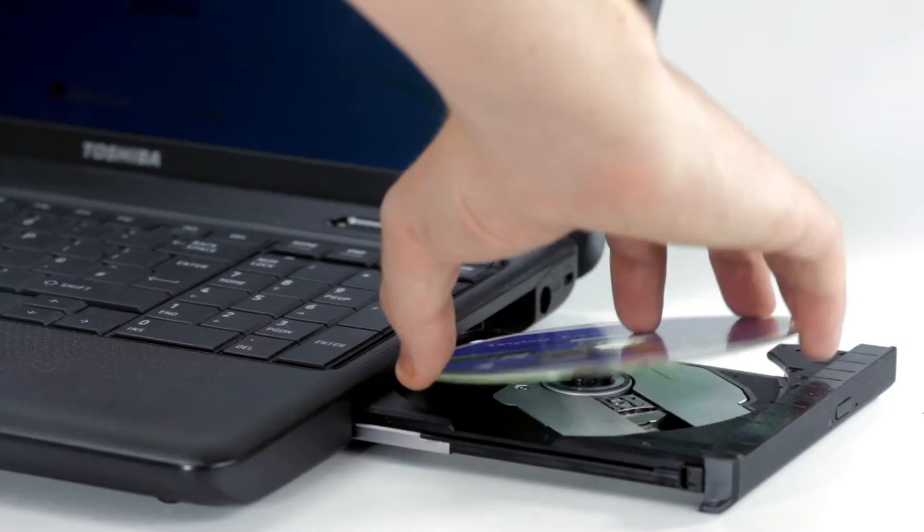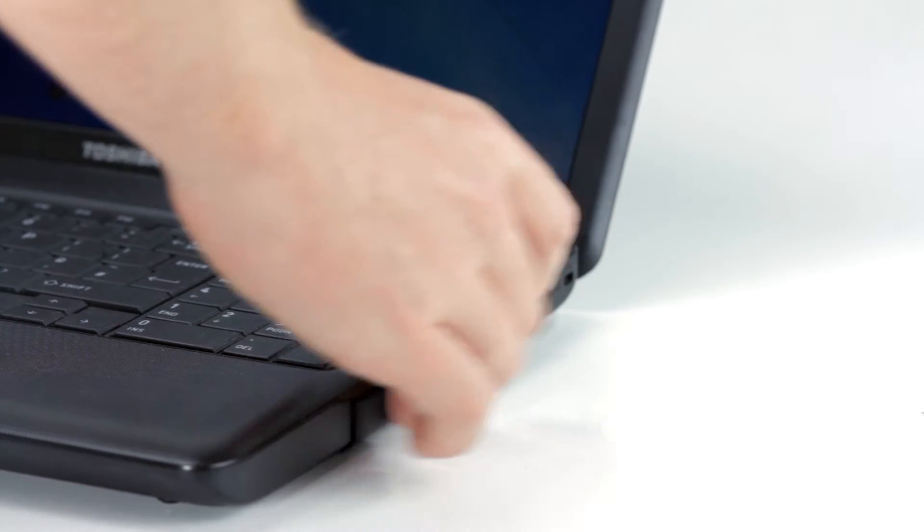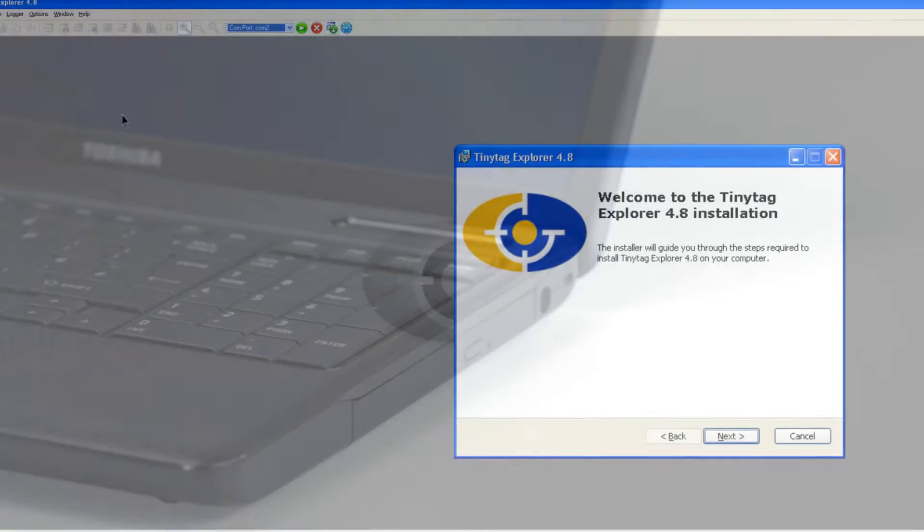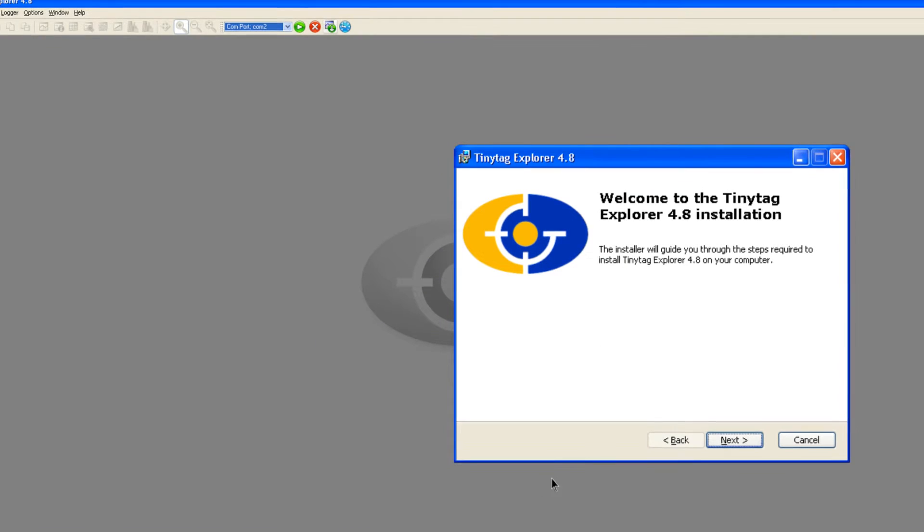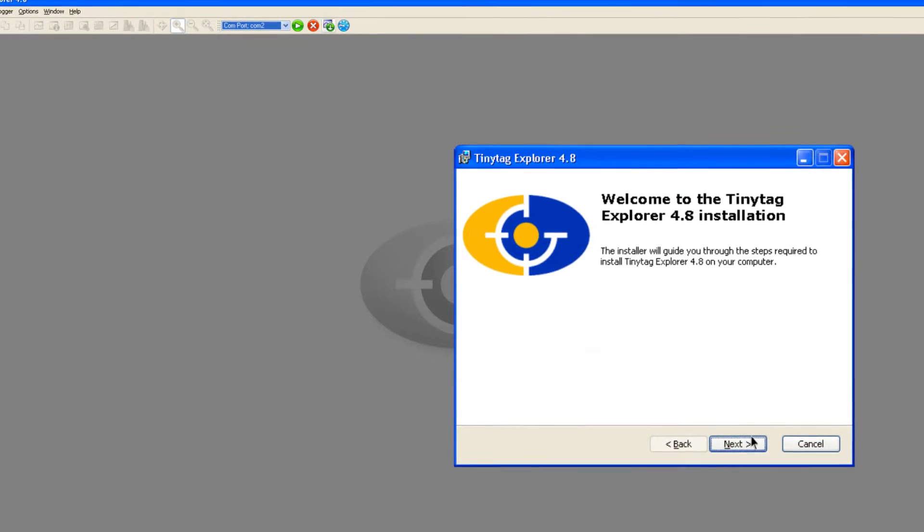To get started, firstly install the software. There will be a welcome screen followed by step-by-step on-screen instructions on how to proceed with the installation.